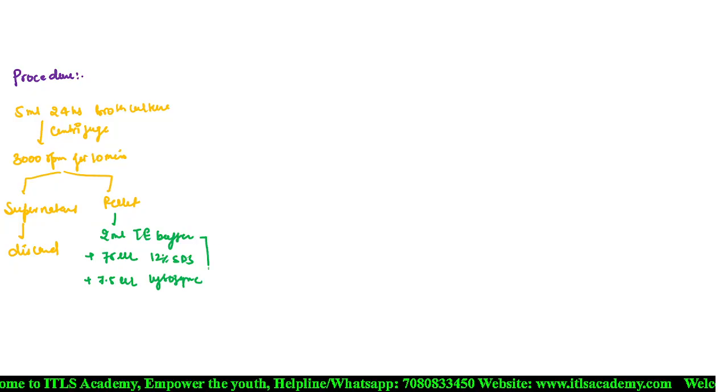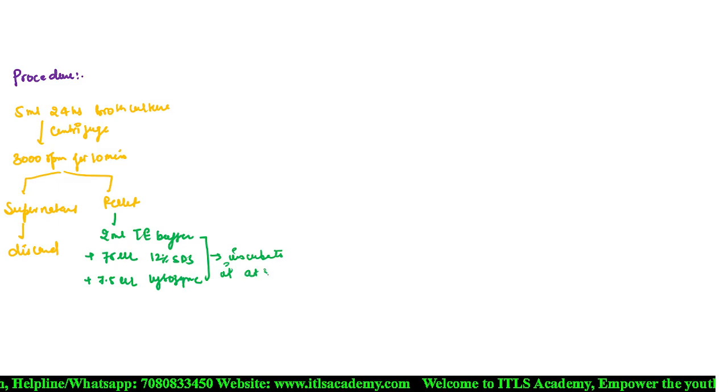Then you have to incubate it at 37 degrees Celsius for 1 hour.